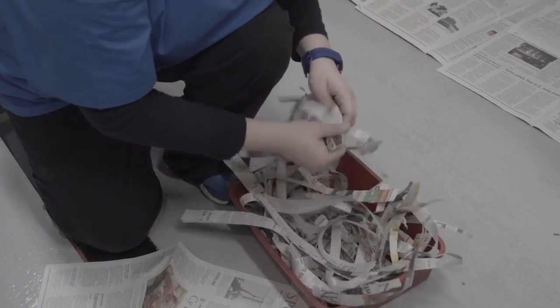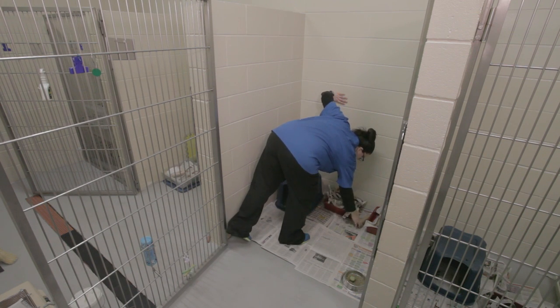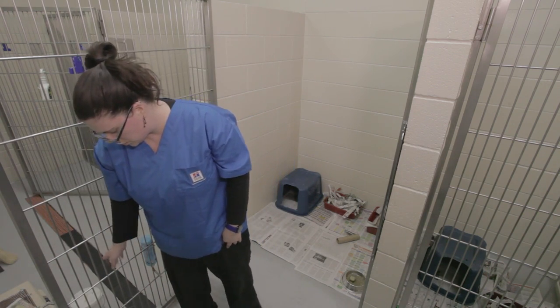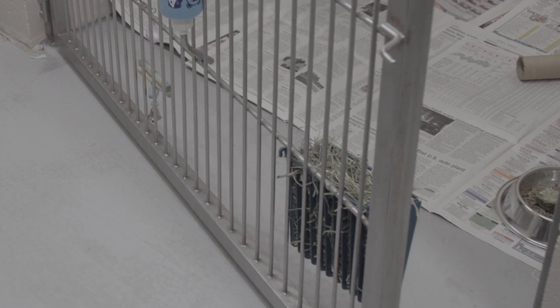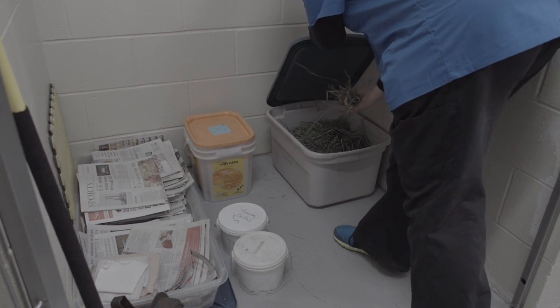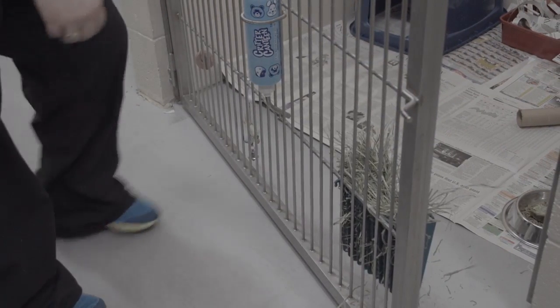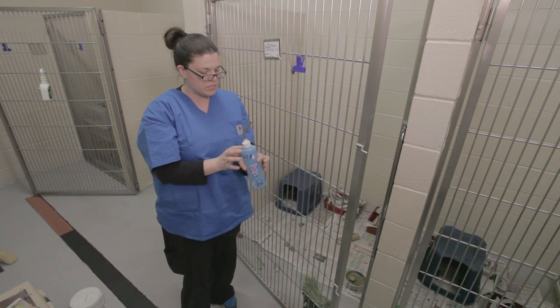There you go. Put that in the middle and the back, and then you'll want to make sure that their hay is full with Timothy hay. You just top it off there. And then you'll make sure their water's filled — use that and take it to the sink, fill it up. This is still pretty full, so good.